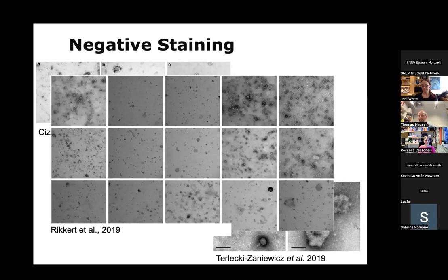And another quick question that I have is about the fixation step, because when I started to work with that, the protocol that we used, after basically leaving the vesicles on the grids, we also used glutaraldehyde to fix the samples. Then when Johanna Hoag came into my lab, that you know very well, she started to ask me, why do you do this? It doesn't make any sense. Then I said, yeah, probably you're right. I don't know, we have always done it like that. So what do you think about this? Is it totally unusable, or can it change something?